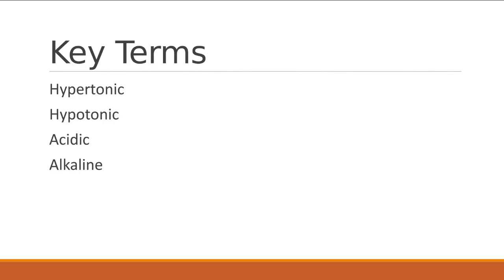Here are some key terms. You've seen all 4 of them before in other classes, but go back and refresh your terminology so that you'll understand what I mean when I'm going through all of these slides.